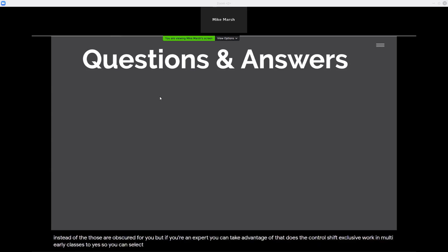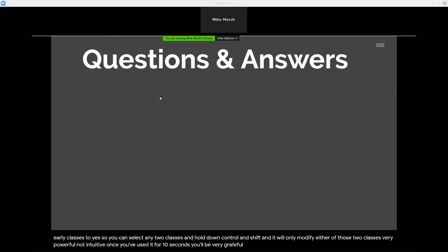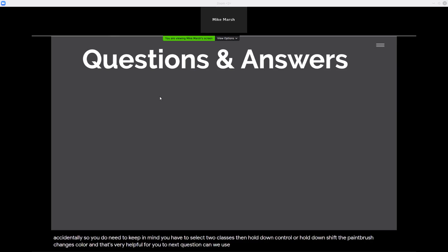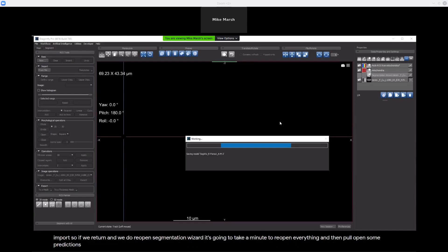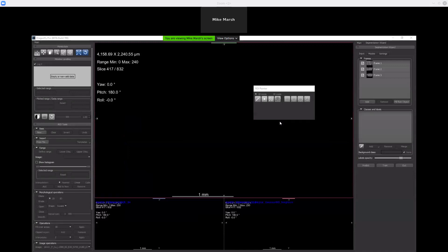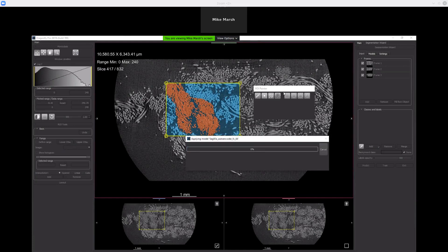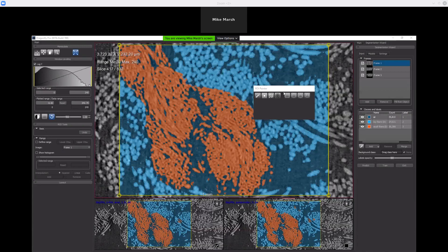Does the Control-Shift exclusive work in MultiROI classes too? Yes — you can select any two classes, hold down Control and Shift, and it will only modify either of those two classes. Very powerful, not intuitive. Once you've used it for 10 seconds you'll be very grateful, but you wouldn't stumble upon it accidentally. You need to remember to select two classes, then hold down Control or Shift — the paintbrush changes color, which is very helpful. Next question: can we use a loaded convolutional network for prediction in the wizard? Yes, you can. In the Segmentation Wizard under the Models tab, you can use Import. If you return and reopen the Segmentation Wizard, under Models I can take any one of these models, see some parameters, and save or import it. The only models you can import are models with the right number of classes. Did I say RC2 is different from the Monday version? Yes, it is — if you want to try out the Segmentation Wizard, you might need to update from Release Candidate 1 to Release Candidate 2.